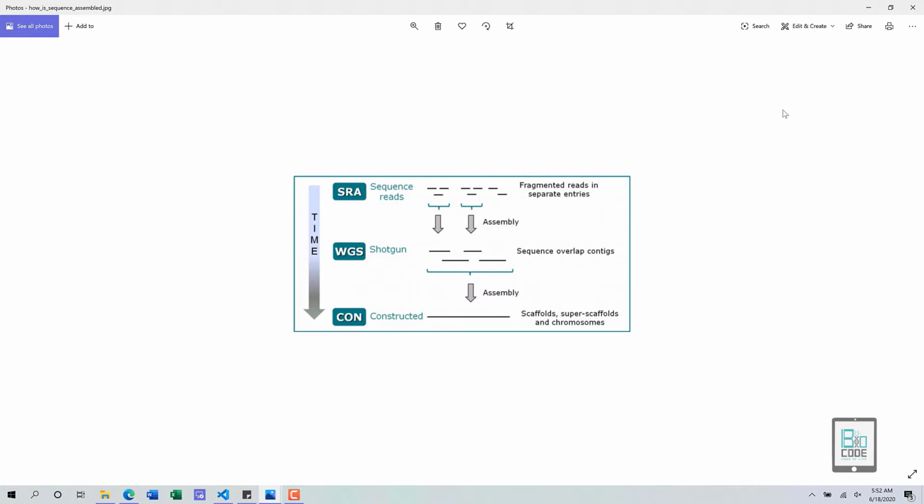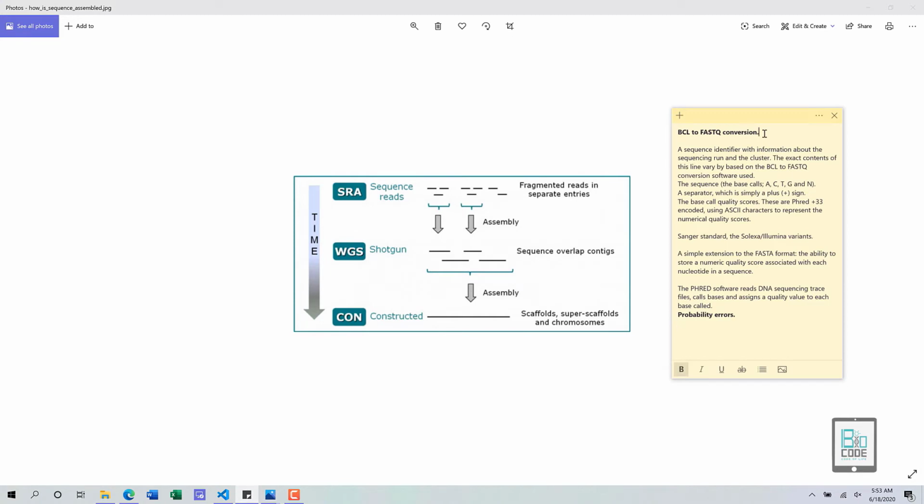In this video, you just need to understand that sequence reads are individual base calls of the genome that we are trying to sequence. That data has to be converted into some sort of sequence data so we can understand it, because a base call is just binary, and we don't really understand it unless it gets converted into a format that is understood by the sequence analysis tools, or even by humans themselves.